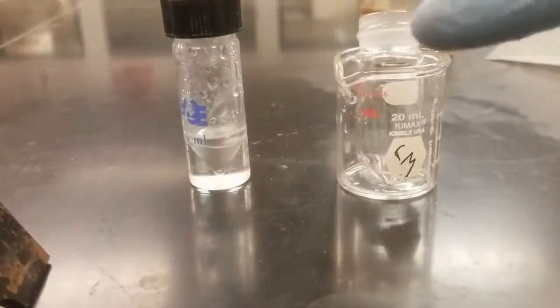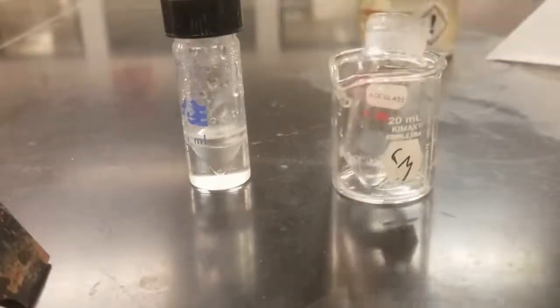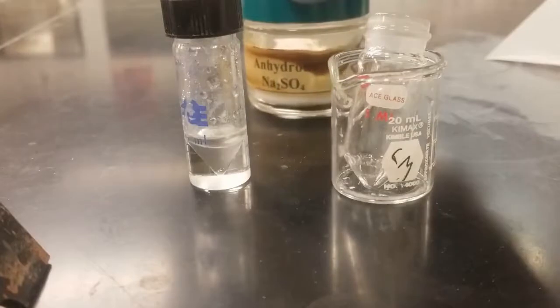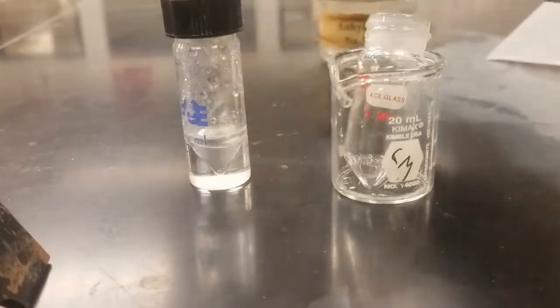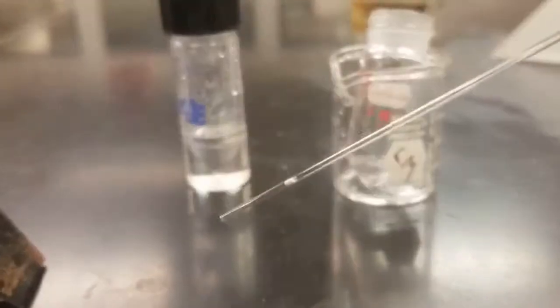All right, so we have our mixture here, and then we are going to separate out the methylene chloride into this conical vial right here. And then in the background here, I've already pre-weighed out some 100 milligrams of anhydrous sodium sulfate, and so we'll just sprinkle that on top. So we've got our filter Pasteur pipette. Going to go ahead and open this up.